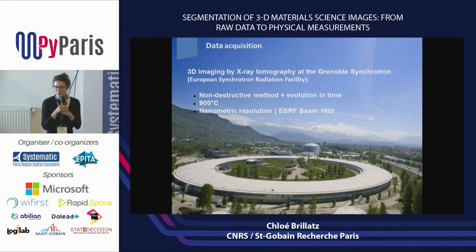So I'll talk a bit about data acquisition because, as some people may know here, in image processing, the better the data acquisition, the easier it is to process the data afterwards. So we went to the synchrotron in Grenoble and we did 3D imaging using the X-ray tomography technique.